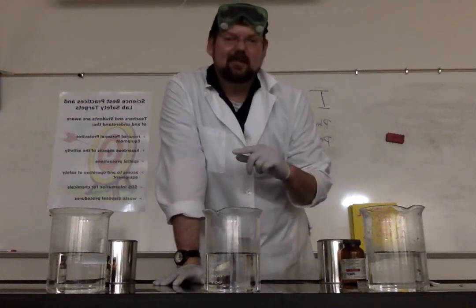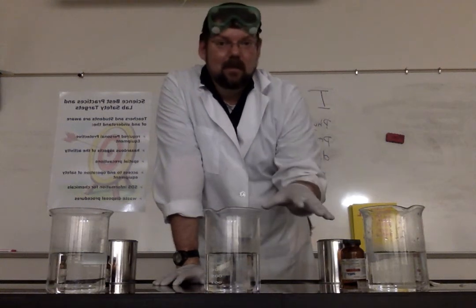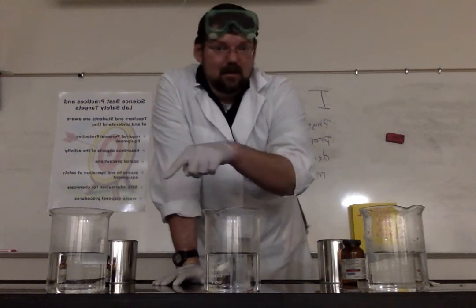Okay, so let me backtrack just a little bit. We do understand what we're working with, but what about when we're all done? Well, this stuff has to be disposed of. I'm making new chemicals because, like I said, they're reactive.